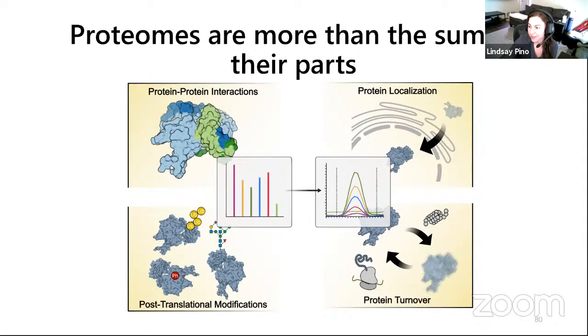Is fractionation recommended for DIA? What type of gradient is recommended? People have been pushing the gradient length for DIA very short. So there's a lot of papers out there right now doing as short as 5-minute plasma gradients with DIA or SWATH. So you can definitely do a short gradient.